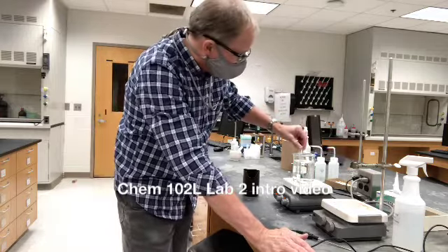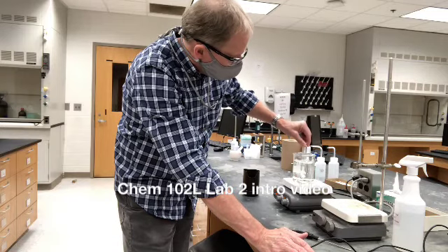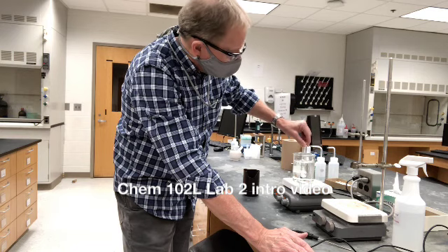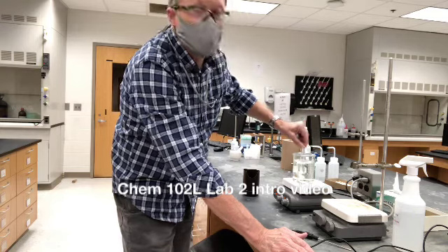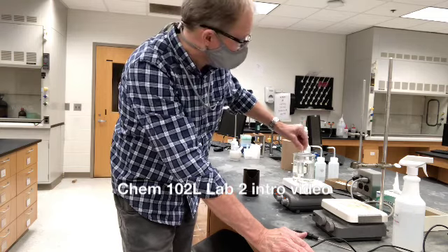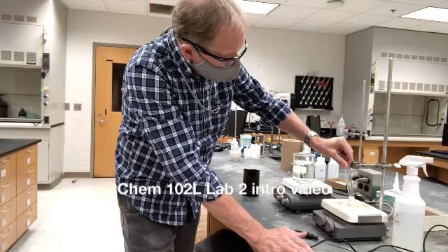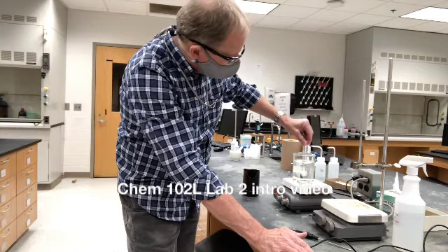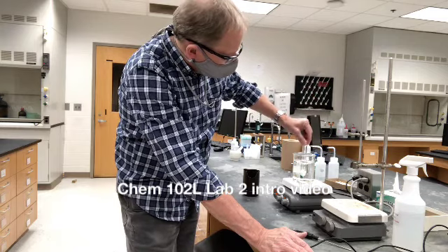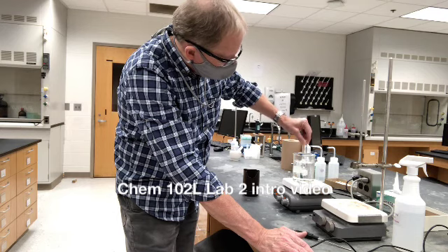And we still need to melt some of this. There's a little solid there still melting, and this is leading up to where you're going to be able to measure the freezing temperature of this liquid. So we want to get this completely melted, and once we have this melted, I can show you how we're going to measure the freezing temperature.